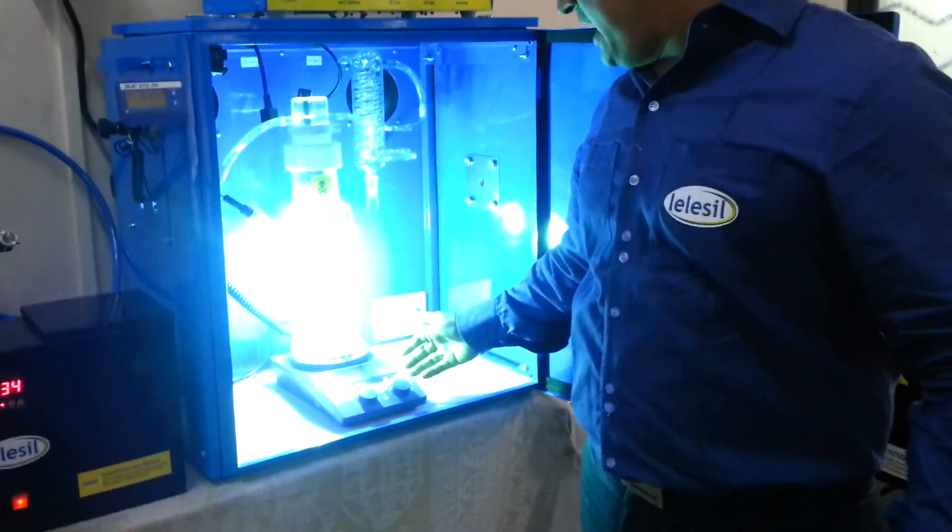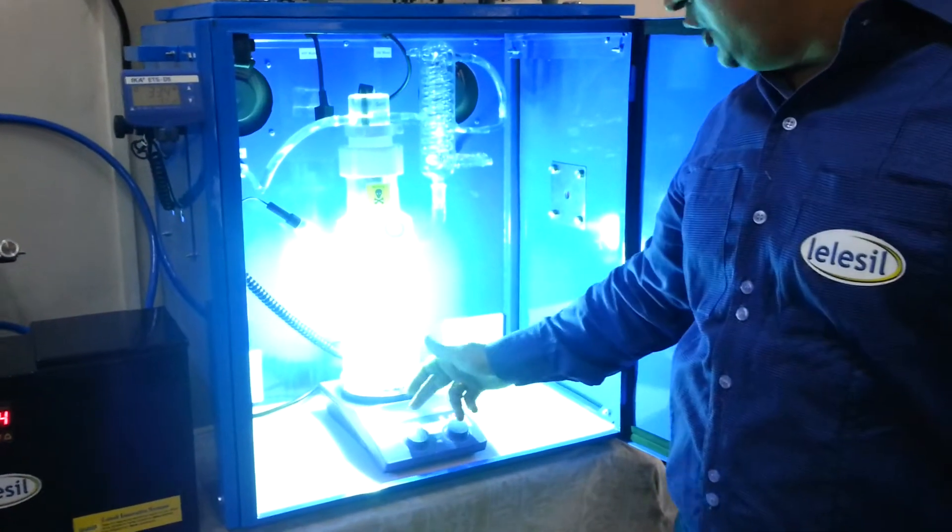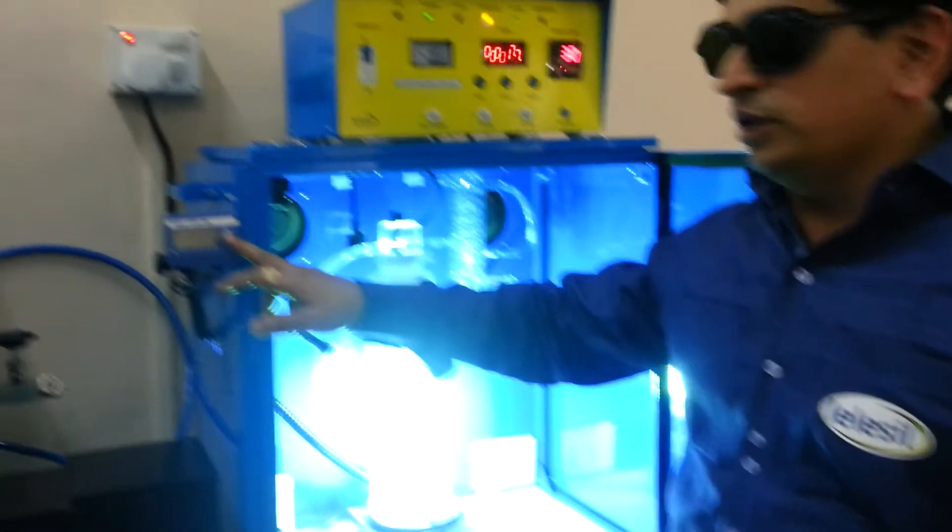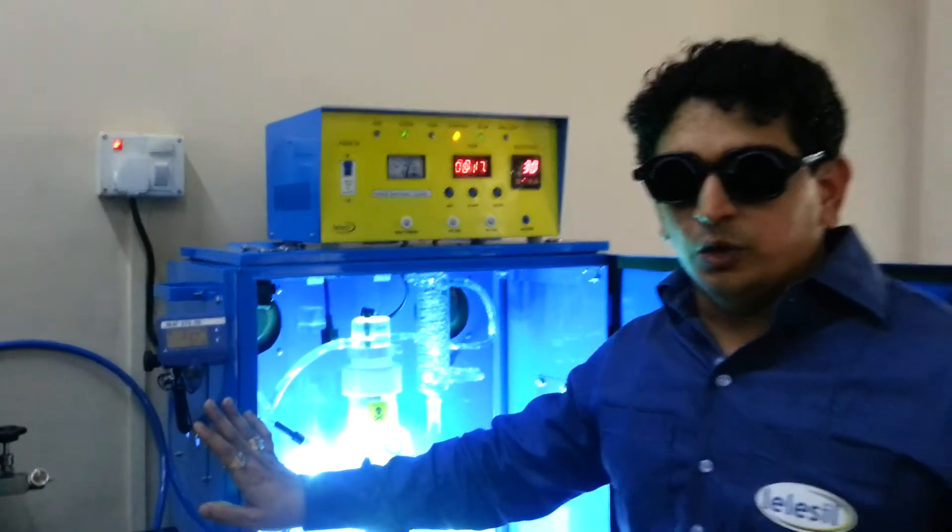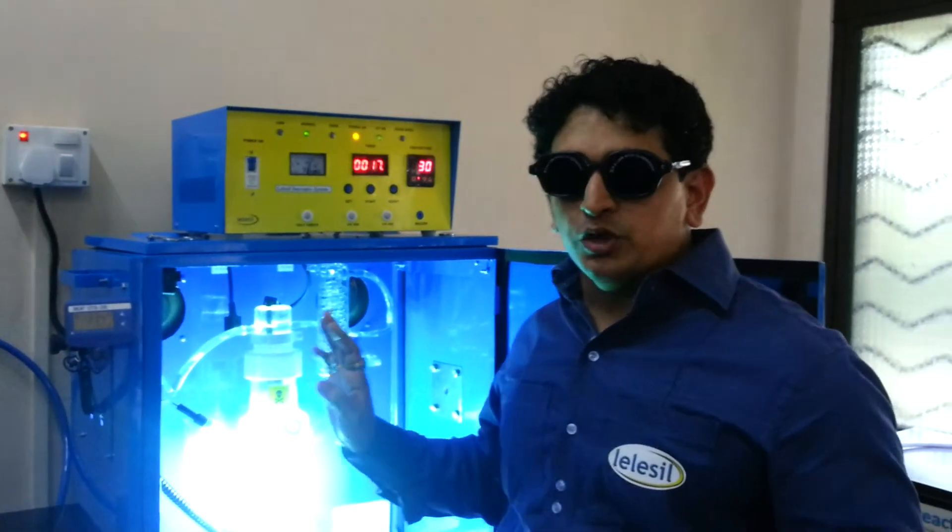This is a special purpose magnetic stirring light with hot plate. You have an external controller to control the system when the door is closed so as to avoid exposure to UV light.